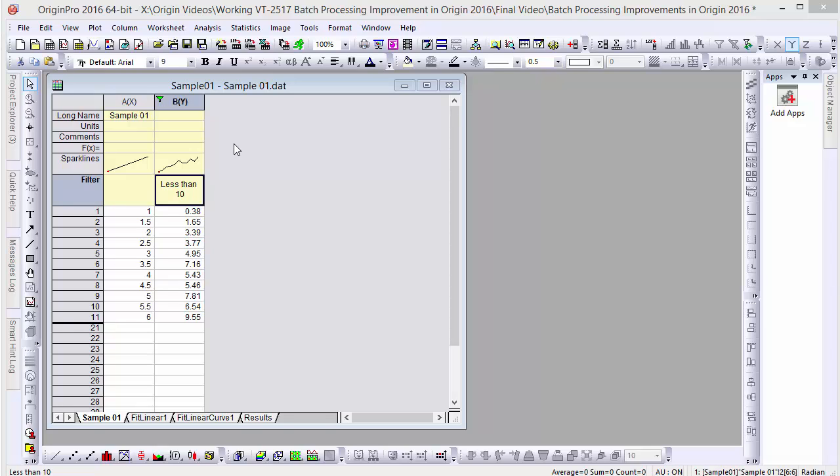Hi, this is Ken from OriginLab. In this video, we'll be reviewing the new script features for batch processing in Origin 2016.